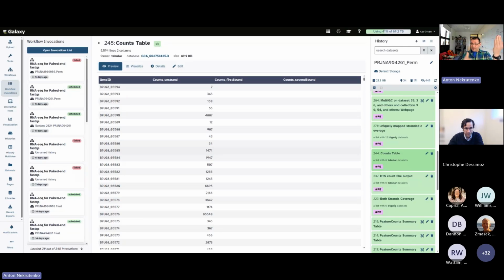I'm comparing wild type against one treatment, let's call it treatment, and I'm comparing my wild type against another treatment. So I need somehow to figure out what is what. Again, if you're doing this experiment, you probably know that. But if you are reusing somebody's data, like in the case of this paper, then you need to do a little bit of forensics.